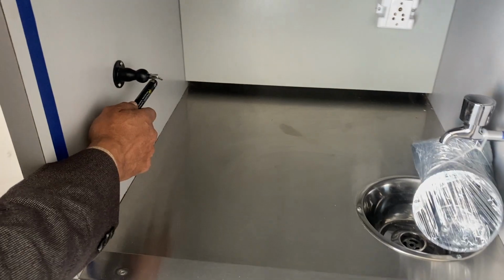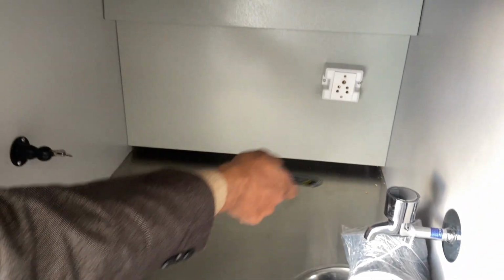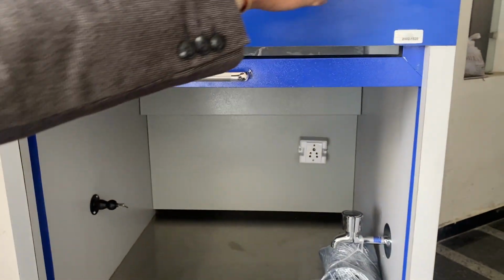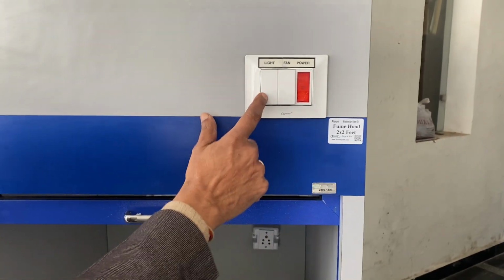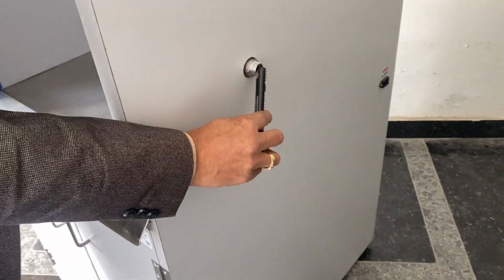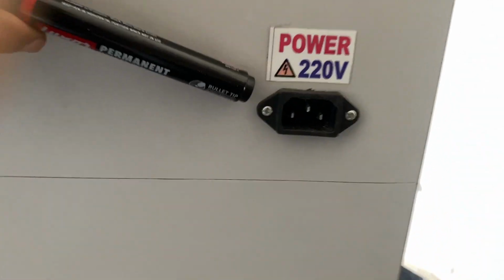This is for the gas tap, for a power plug or any other utility inside. And this chamber is stainless steel. On the top side there is an exhaust. You know this, there are fan, power and light. Light is also inside. And on the right side we have the plug for water to the tap, and another one for the 220 volt power button. And this one is exhaust.